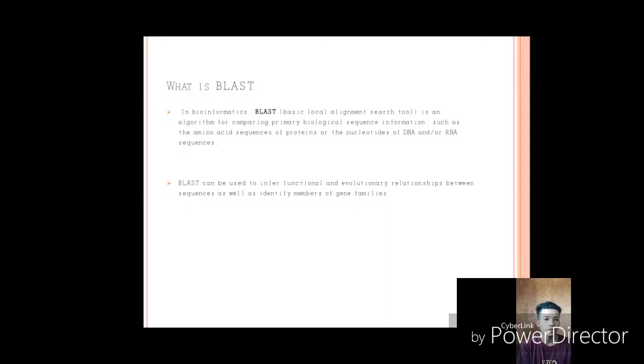BLAST can be used to infer functional and evolutionary relationships between sequences as well as identify members of gene families.